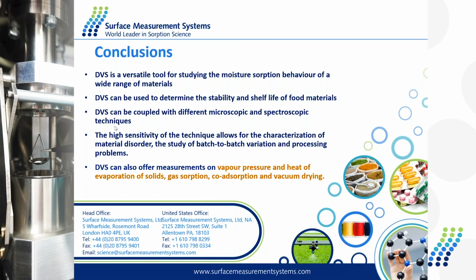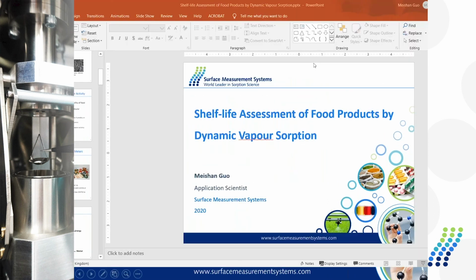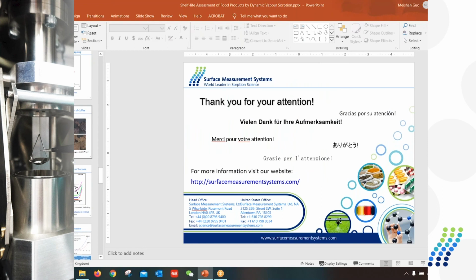This is basically similar to DSC and TGA, but instead of ramping the temperature, we ramp the humidity.